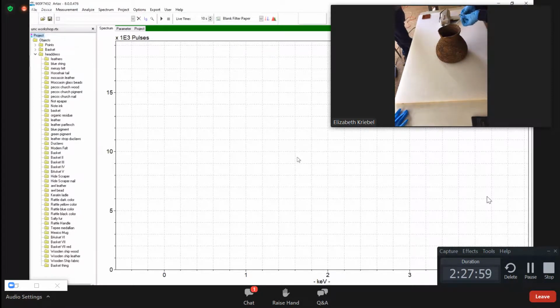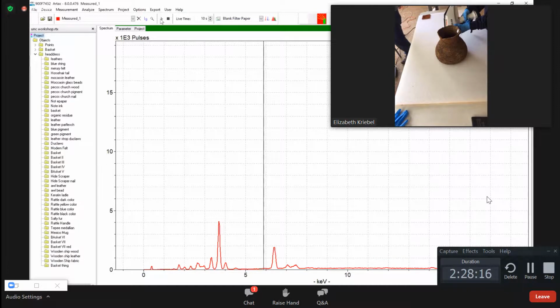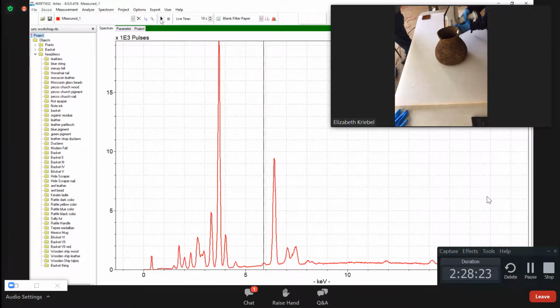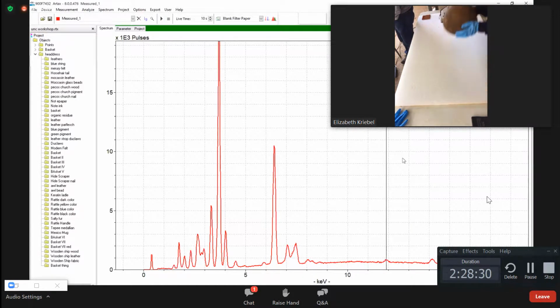And we've got object number 67.9.25. Sorry, there are points in between those. All right, and kind of the same thing. Good blank spot. Let me know when you're ready. Ready. Starting. A little bit of salt on this, a little bit of chlorine, but that's it. Great, so the baskets are safe. Yeah, your baskets are right. And a little bit of bromine on that too.